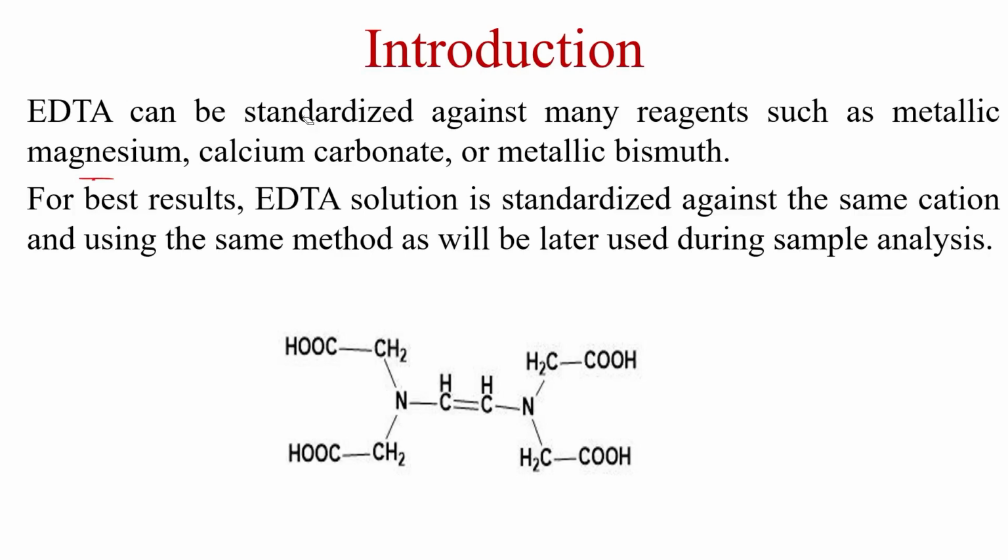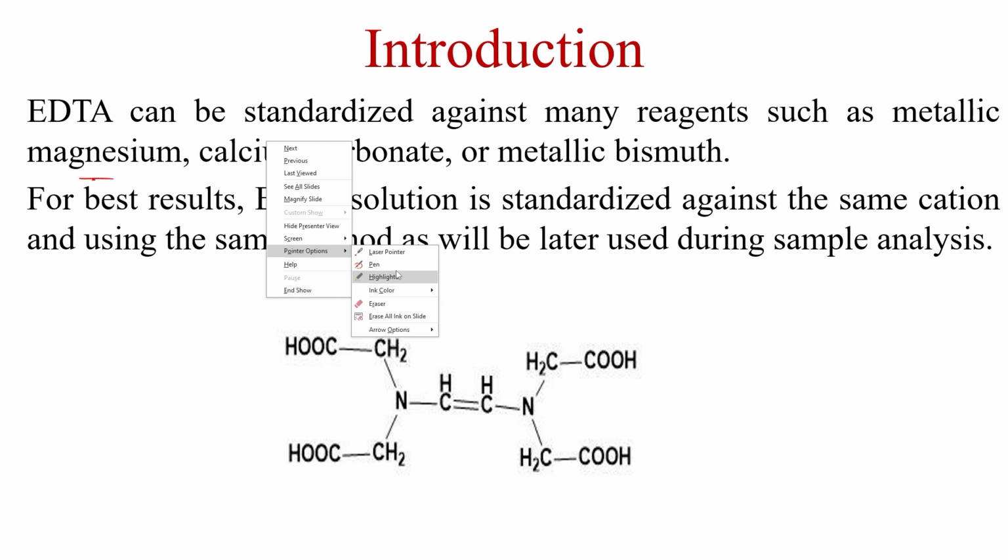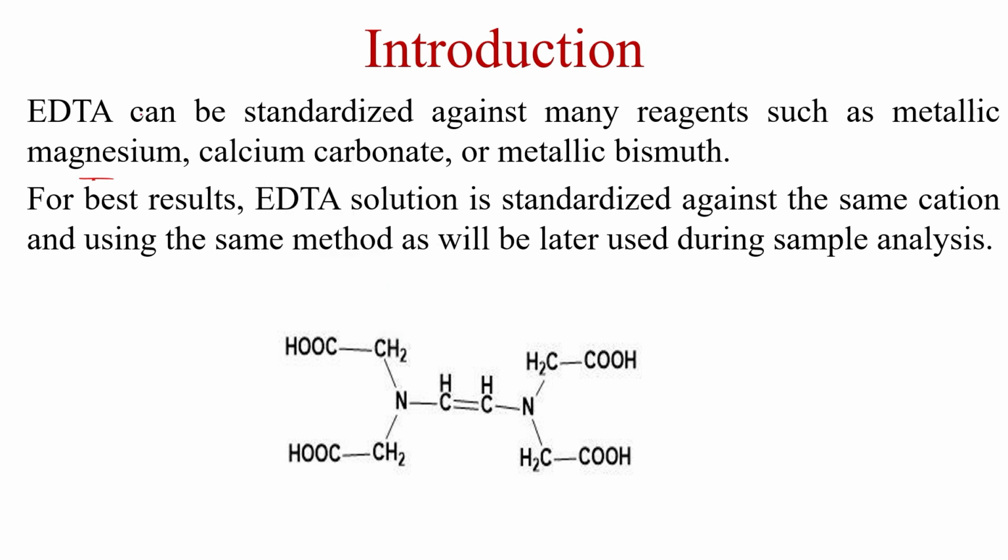So here it's written that EDTA can be standardized against many reagents such as metallic magnesium, calcium carbonate or metallic bismuth. So generally we are standardizing EDTA solution using calcium carbonate solution.